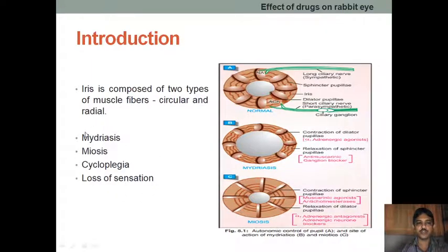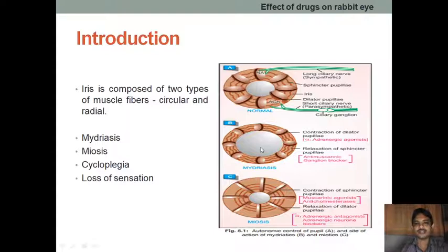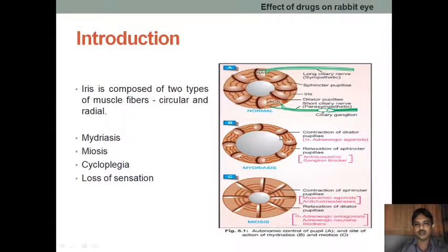There are four types of responses we are going to observe when we perform the experiment. The first is mydriasis. Mydriasis means dilation of the pupil — dilation of the pupil.